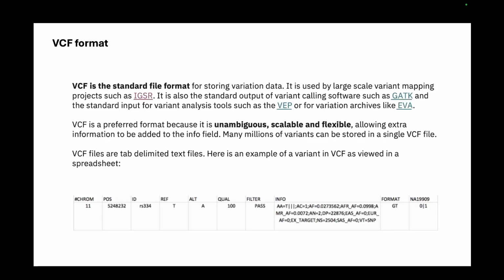After you have found the different variations, you would like to know their functional impact and how frequent they are. So you have downstream annotation processes, which pick up data from different databases, including the Thousand Genomes database. This database has the SNPs and SVs that they have already found, with a frequency associated with them for its own cohort.